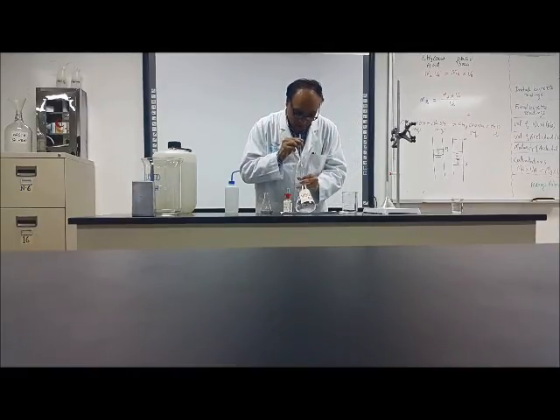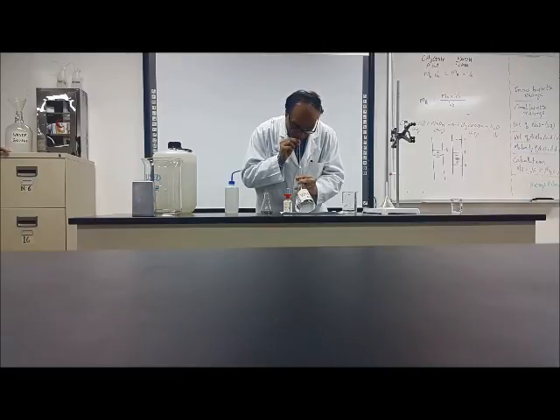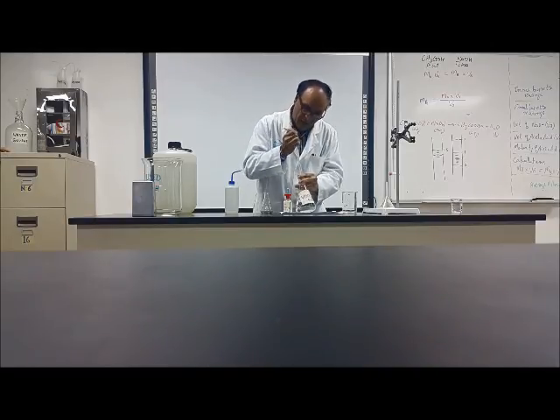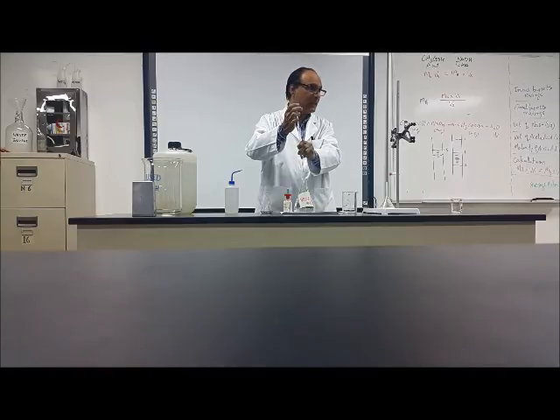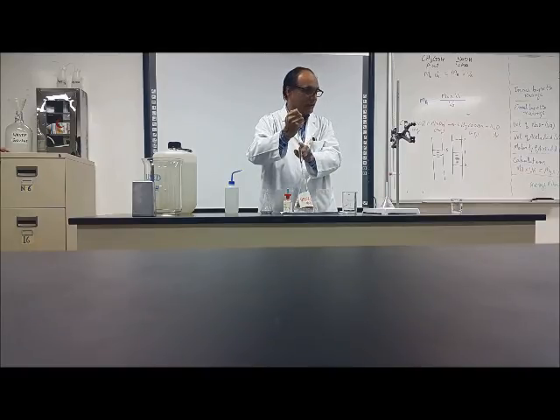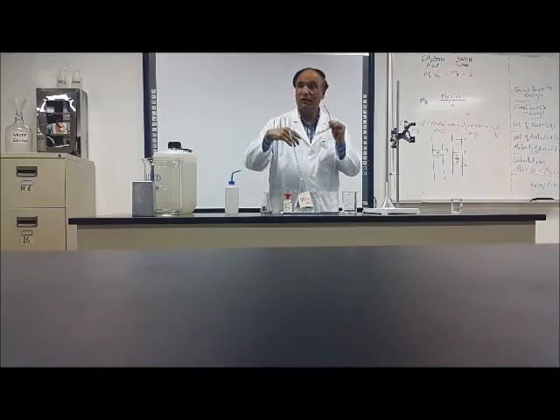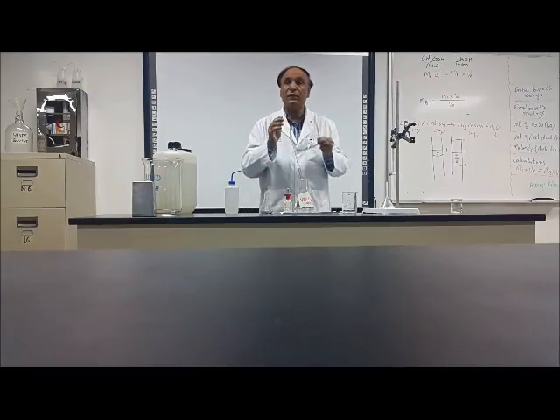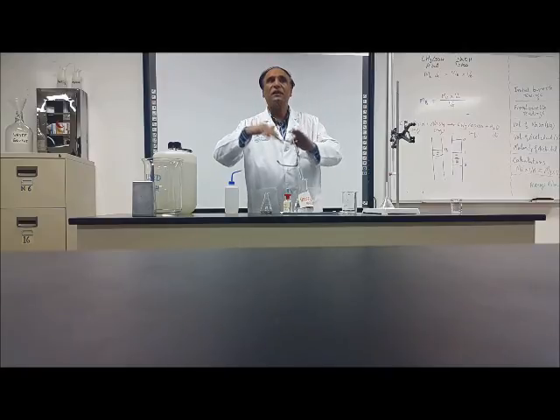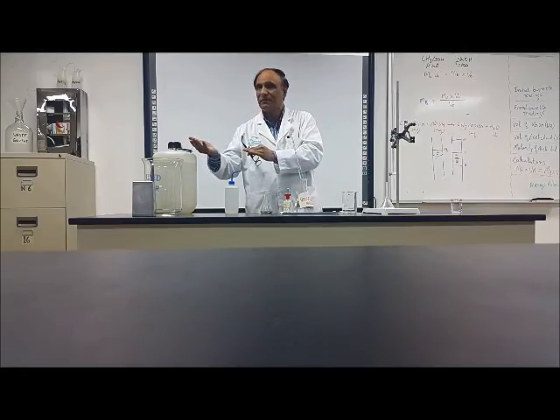And I will take this one. I will take it above the mark. Did you see? I will take above the mark and I will release the air from my finger. When I release, it will go down like this. And it may go down like that. Down. So what to do? Again. Take it again. So maybe you have to do it many times. Okay? Did you understand? So nothing to worry. Don't get confused. Nothing to worry. If you take 5 times, 6 times, because you are doing it the first time. So no problem.